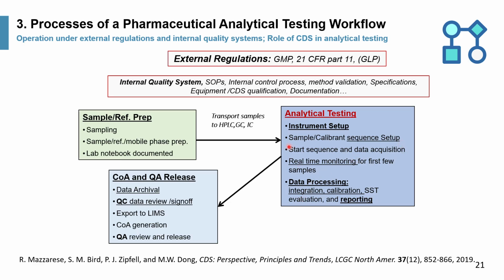You start the sequence. You typically watch the sequence for a while. You do some real-time monitoring for the first few injections, and make sure everything's working properly before you leave the system on autopilot. And then typically we would do batch processing the next day.